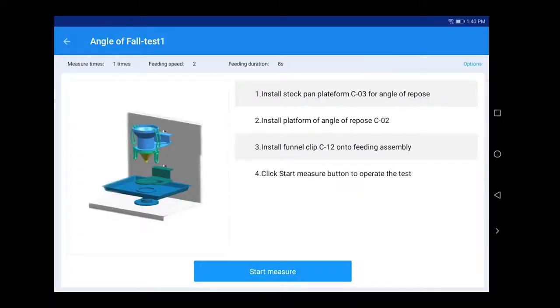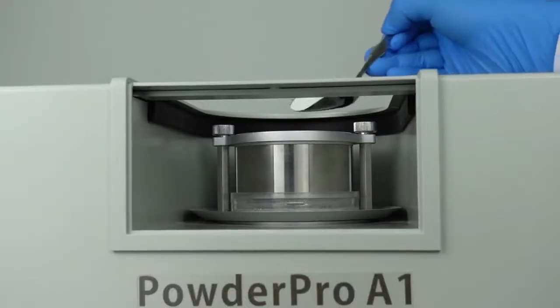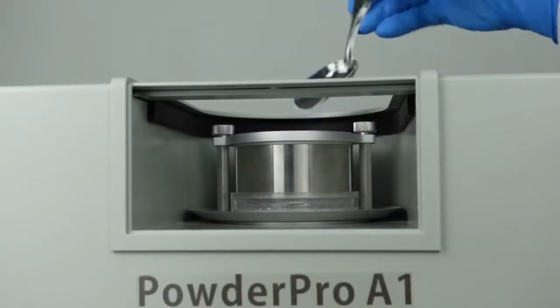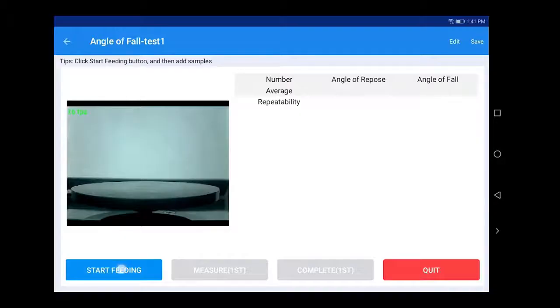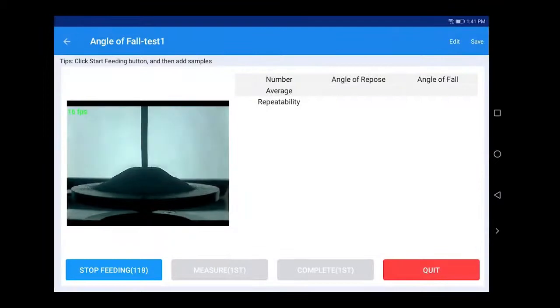Click Start Measure. Then use a sample spoon to drop the sample through a vibrating sieve and feeding funnel above the angle of repose platform. Then click Start Feeding. Keep feeding until it gradually forms a powder cone.